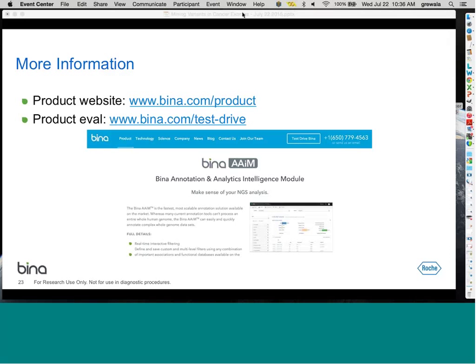I didn't mention export. There's a question here about exporting variants. On the UI, you might have seen a place where there was text about exporting 1,000 variants. The 1,000 variant limit is something we keep just for the evaluation or the demo version of the software. In your own version of the software, you could export as many variants as you like. The export formats are currently CSV, or comma-separated annotations, or MAF format, and we will be adding VCF export as well.